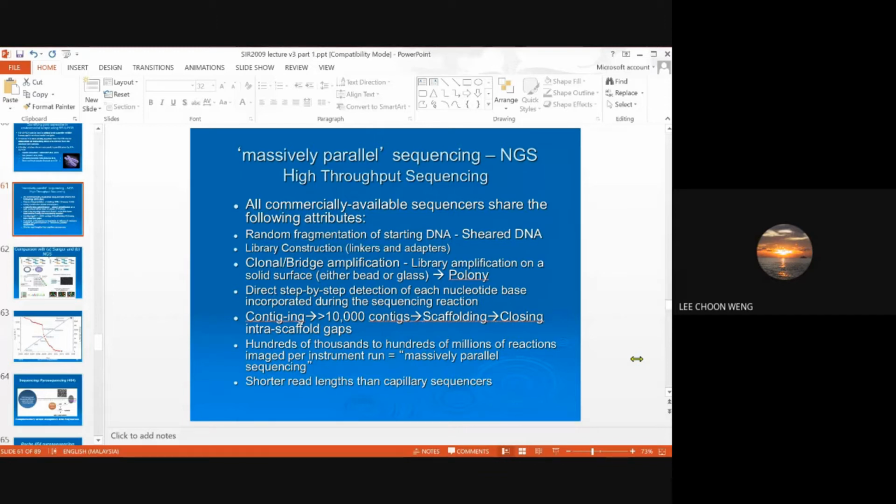Okay, what are the special occasions? You can still use the cloning approach when you are looking for rare bacteria. So one where you feel that the database is not available yet, or where the database is not good.